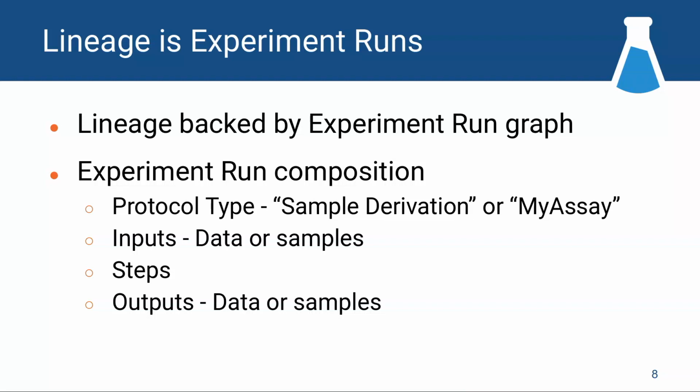There's lots of documentation on our labkey.org website about the terminology. This is a very pared down list of the terminology that we use for the experiment framework: protocols, inputs, outputs, and steps. There's protocol applications that capture the time point at which that protocol was applied, things like that.